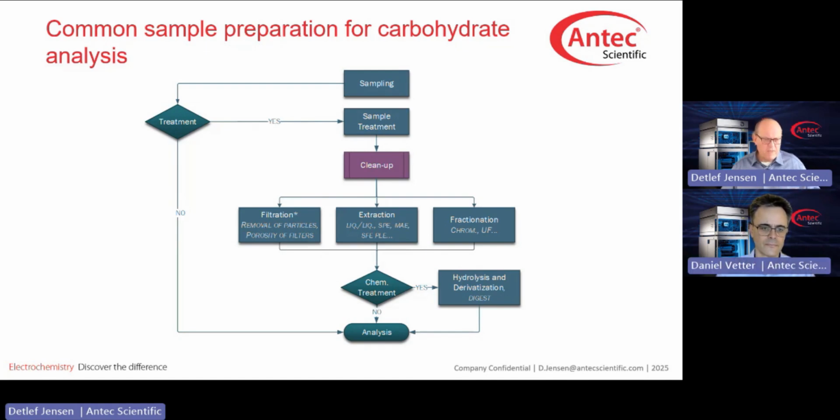If you say no, you save the time and effort you would spend on sample treatment, but you pay a price, maybe in terms of precision of the analytical method, maybe in terms of the lifetime of the consumables. So there are decisions to make, and these decisions have consequences in daily operation. We will talk about these decisions and their consequences in the following part of the presentation.